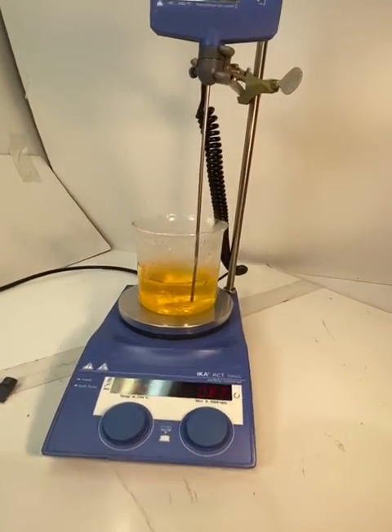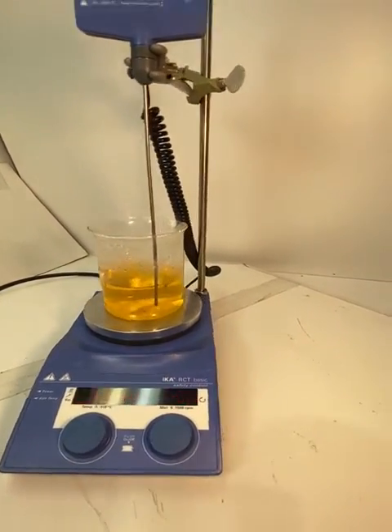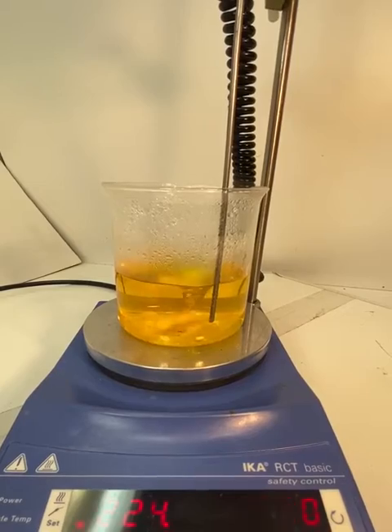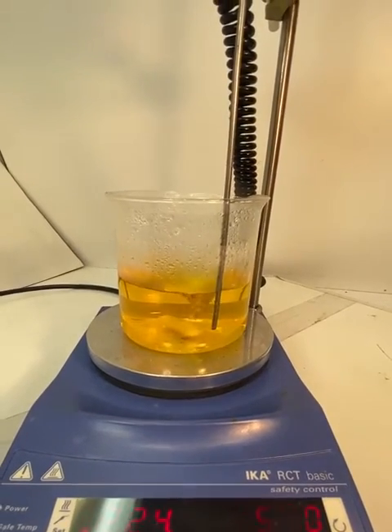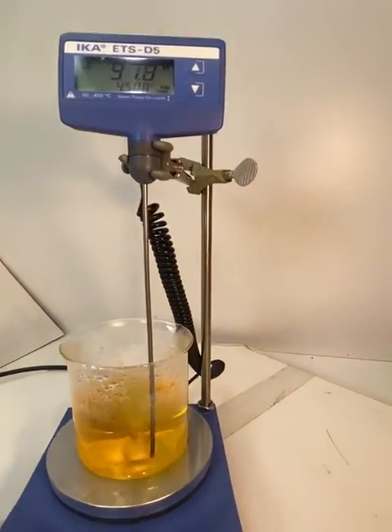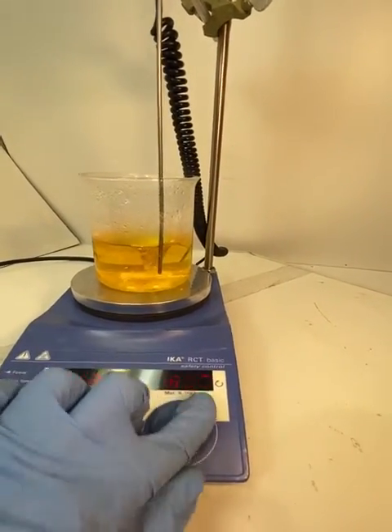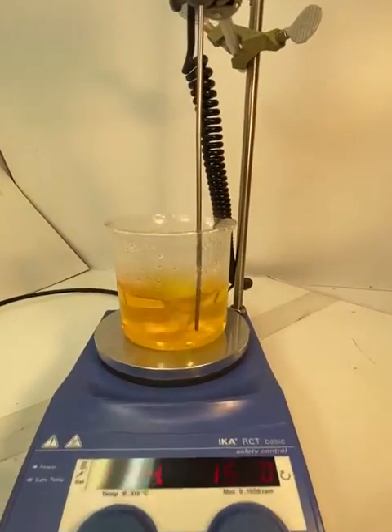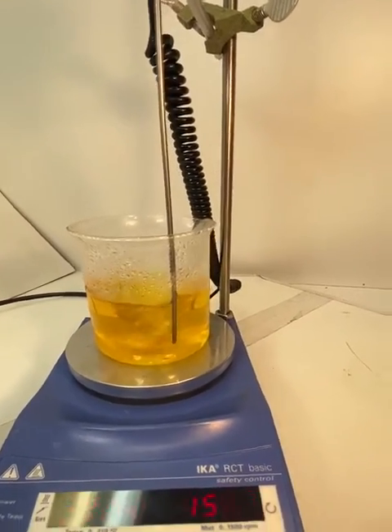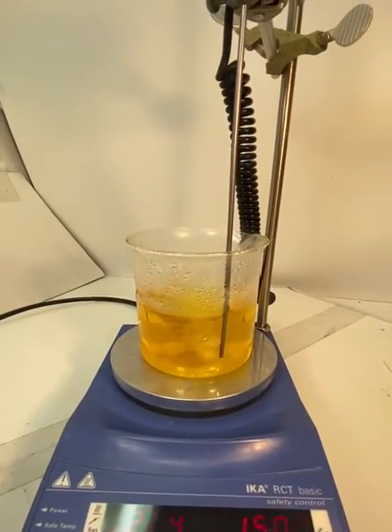Here I'm showing that it's working smoothly. I set it up for 500 RPM — you can see it's very smooth and nice. As you can see it's almost boiling, so I can even increase the speed. It's still working fine and perfectly at 1500 RPM.